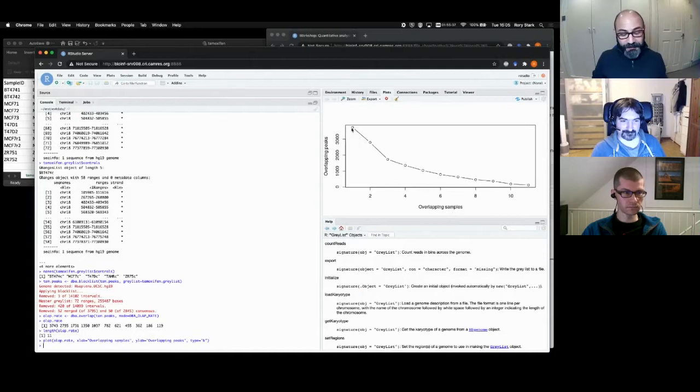There is roughly a geometric drop-off, and this is because peak calling is actually quite noisy. If each level is half of the previous one, if it's no worse than that, I feel okay about the experiment. If there's a drop-off worse than that, often you have some outlier samples that might need to be eliminated because they have nothing in common with anything else. Here you see we're actually doing better than geometric. It's better than half for each of these. It's a pretty good experiment. We get pretty high agreement. We've got a pretty good antibody there for the estrogen receptor.